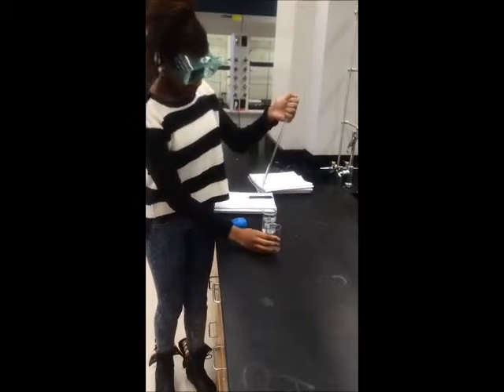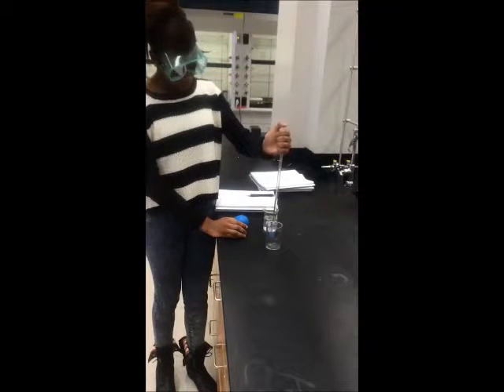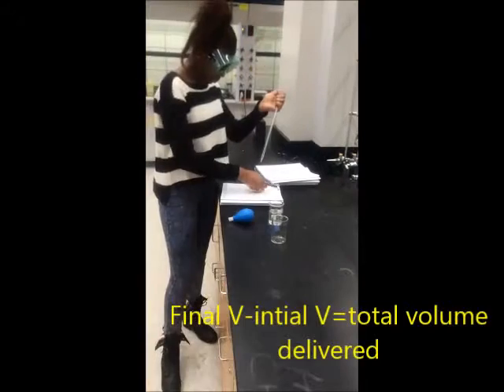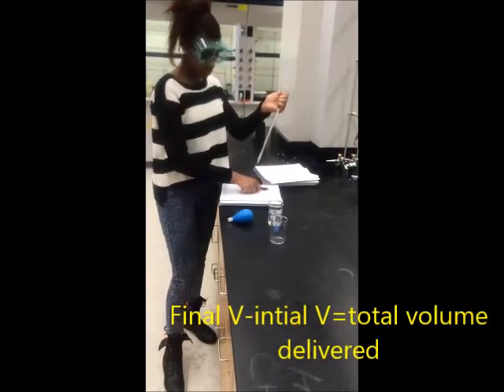Release some of the water into the new beaker. Then record your new volume with the same steps as earlier. This will be your final volume. Then you should do the simple calculation to find the total volume delivered.